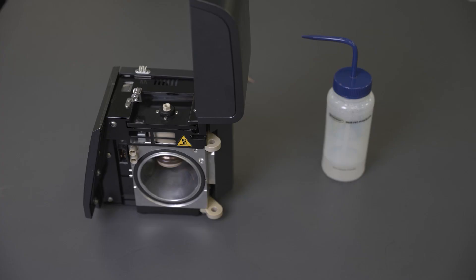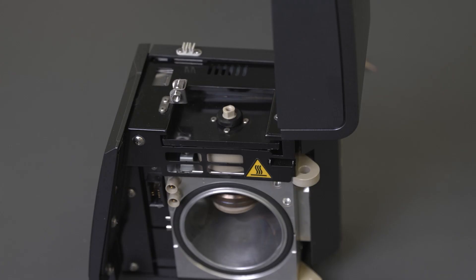If the ESI capillary needs to be replaced, retract and remove the ESI spray needle by loosening the locking collar and rotating the peak nut counterclockwise using the wrench.